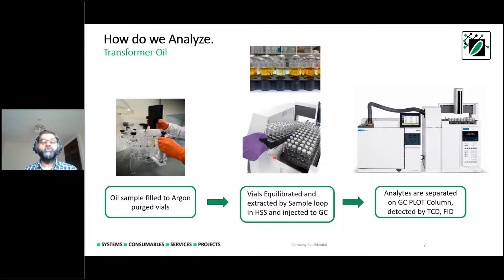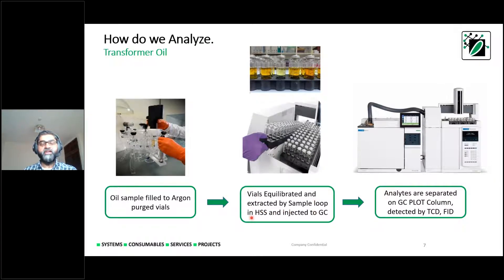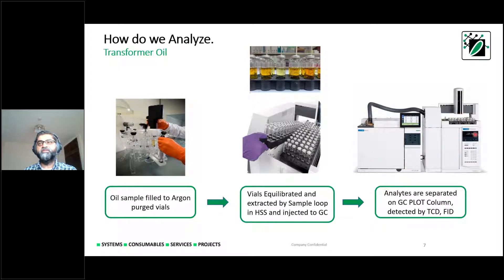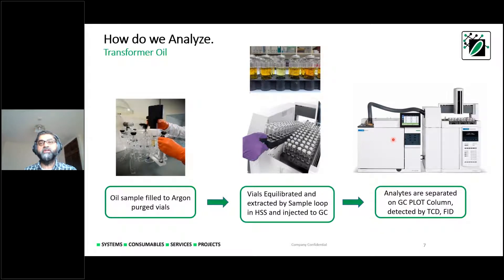The vials are placed into racks for the headspace sampler — available in sizes from 12 to 111 vials. They are equilibrated in the system, extracted by a sample loop inside the headspace sampler, and injected onto the GC. The GC is seen on the left side and the headspace sampler on the right side. The sample is transferred using a fused silica transfer line for sensitive analysis onto GC PLOT columns installed in the GC oven.